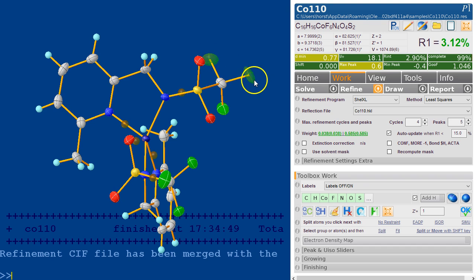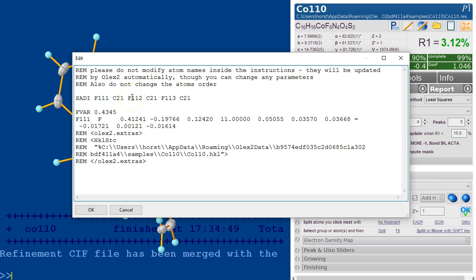We can verify this. We select two of those atoms or any one. Just one of them will do. And click on this symbol here, which shows you the relevant part of an INS file. We don't show the whole INS file, but we know the SADI is in here. The fact that those atoms have been renamed has been taken care of completely by Olex 2.